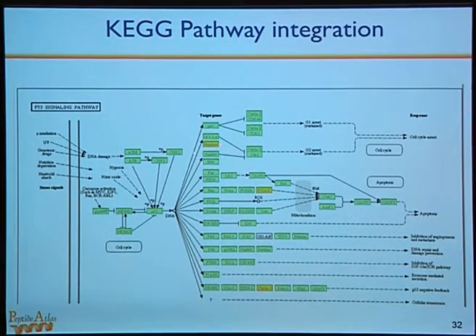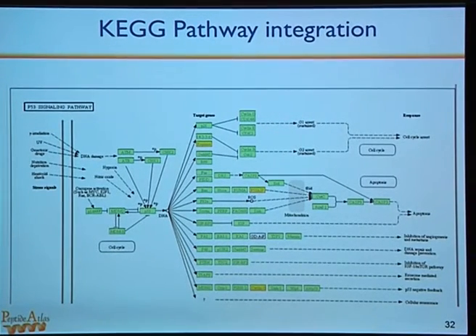The ones that are yellow, we don't have any information for. And in some cases, there are boxes on the KEGG map that are clear, without color. Those are proteins in whatever organism. So for whatever reason in this organism, that is not represented, or we were not reported a protein accession that represents that particular entity. And for some of the lower organisms, it's much more common to see empty boxes.